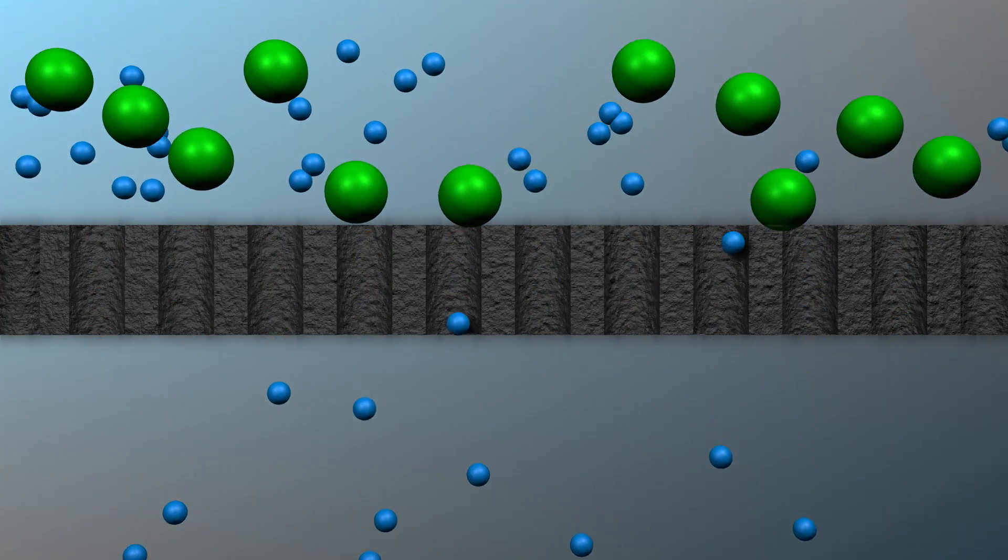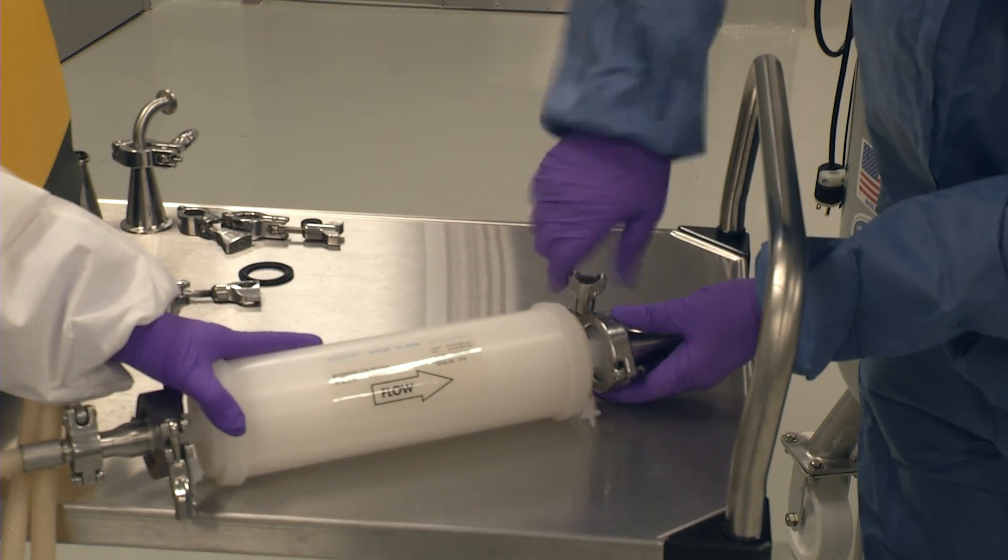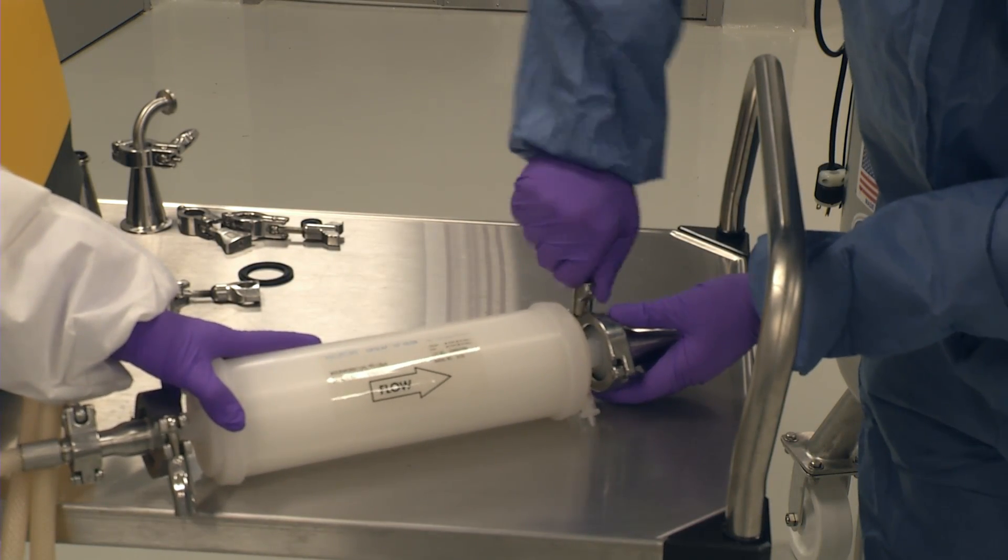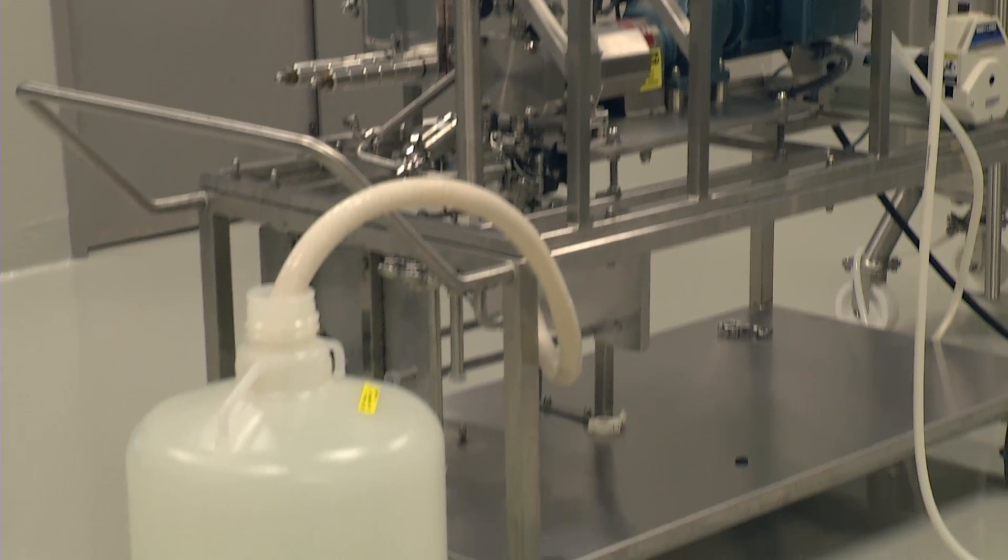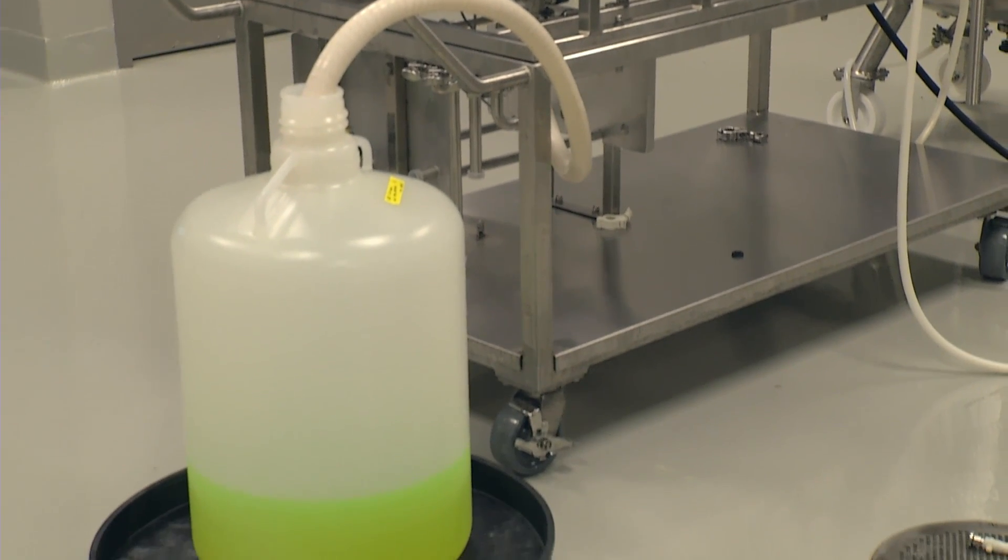When this process is complete, the GFP solution is routed through a 0.22 micron final filter and then collected in appropriate containers, usually bottles or bags. The purification process is complete.